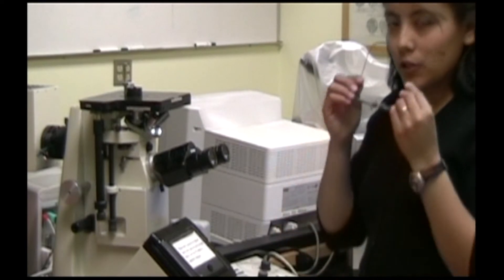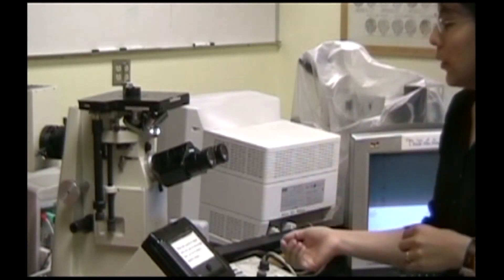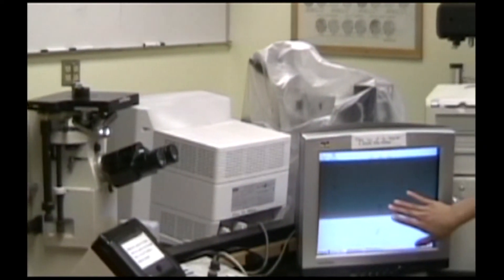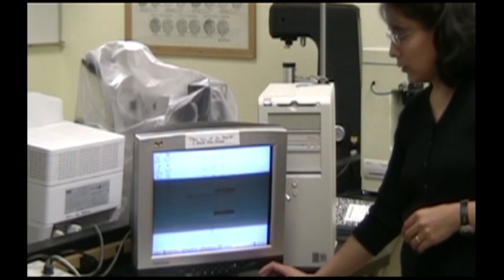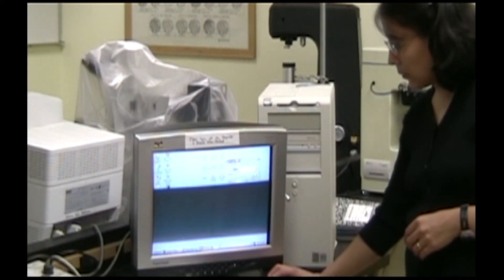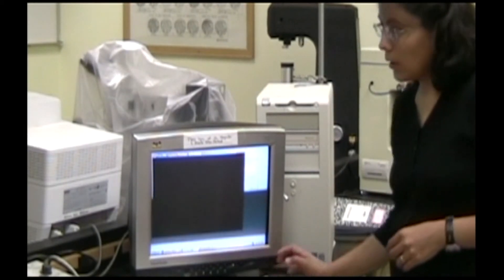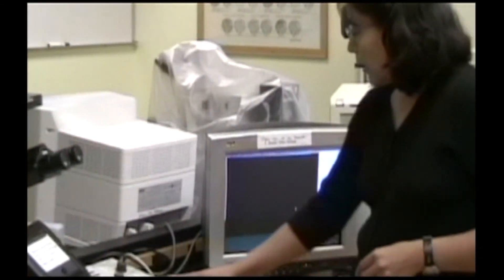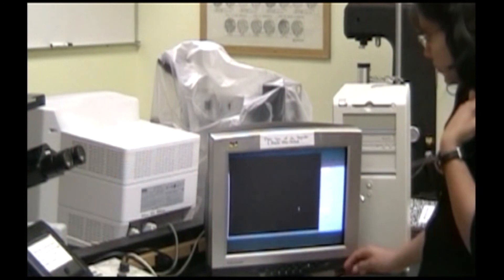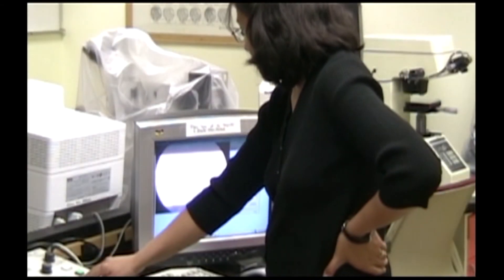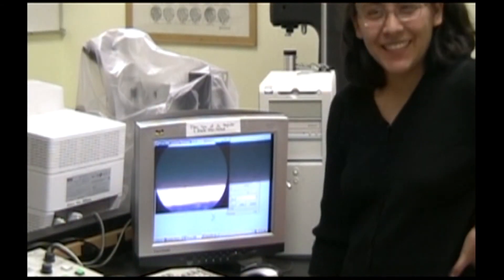If you want to take a picture of your sample surface, you open the software here on this computer. It's a pixel-link capture software. You pull out a knob here that's labeled on the side of the optical microscope and you turn on the exposure box. You should also open the shutter.